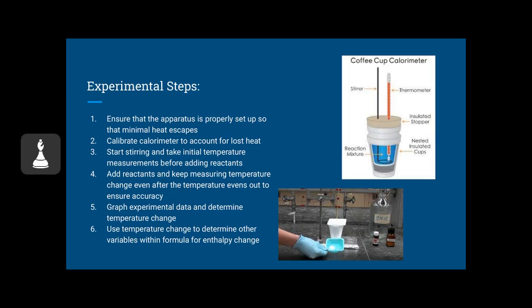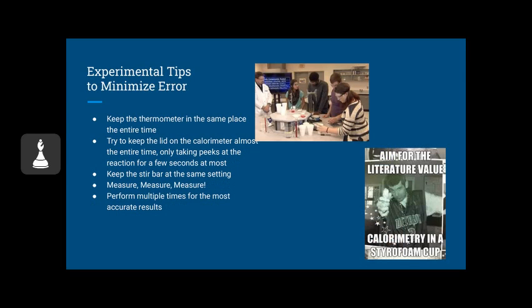That is the steps of the experiment, and it's relatively easy to carry out as long as you remember these tips. You have to keep the thermometer in the same place the entire time so that it doesn't touch the styrofoam cup or get somehow out of the solution and the water and not measure anything. You also have to try to keep the lid on the calorimeter almost the entire time.